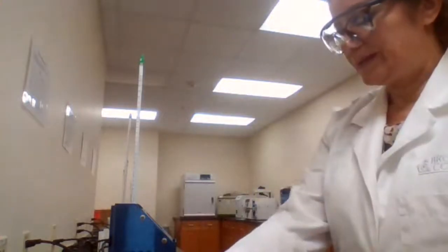Turn off the melting apparatus. I'm going to take this sample because we need to combine it with the other one for the mass. Go back to the main room.